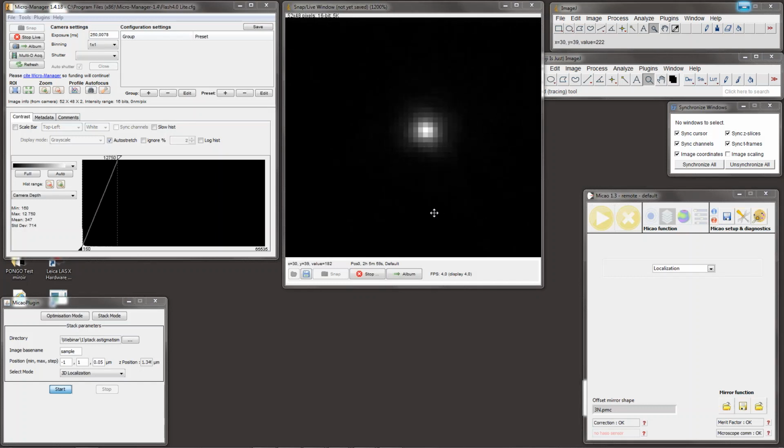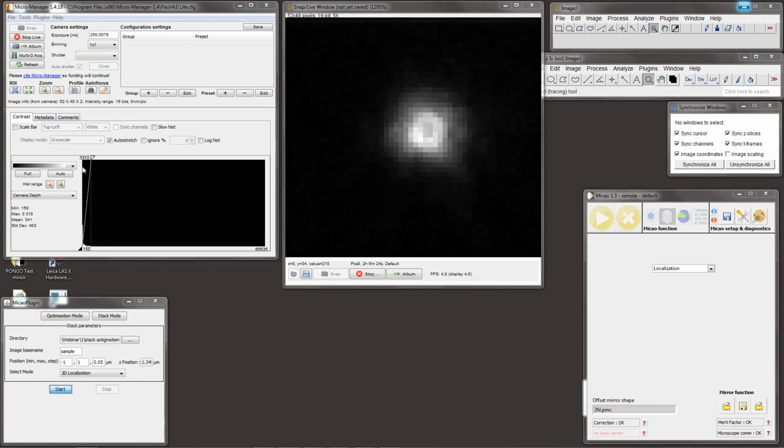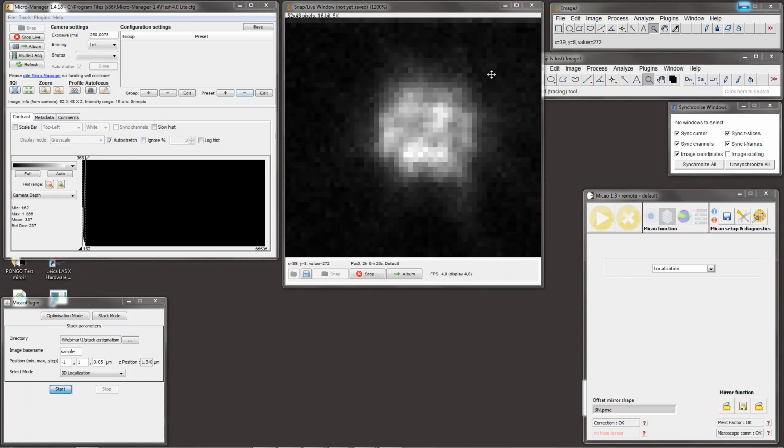We'll start by showing an already optimized point spread function, so you could judge what the differences are, how a good point spread function should look. In the focus, the intensity is maximal. If we go to one or the other side of the focus, the intensity drops pretty quickly, and we get a featureless shape of the point spread function.